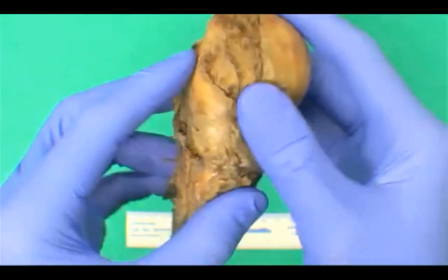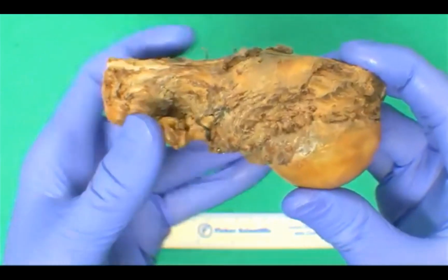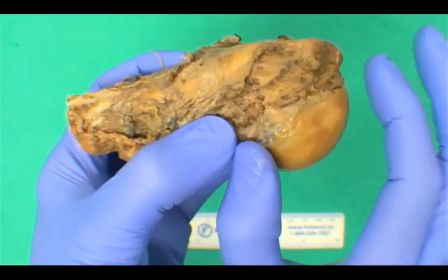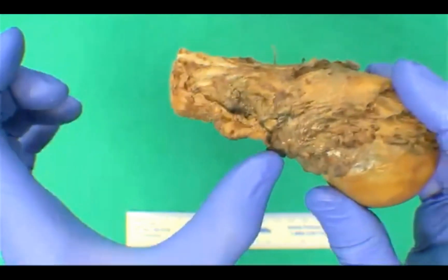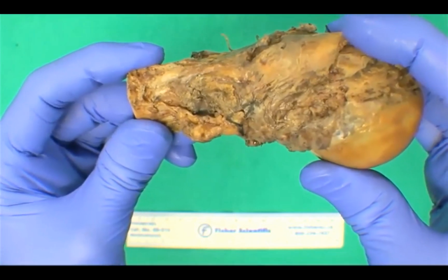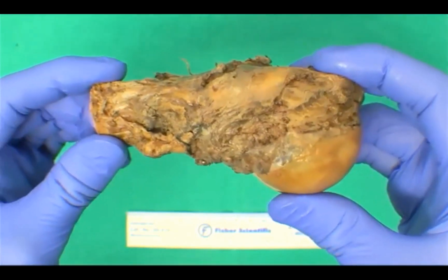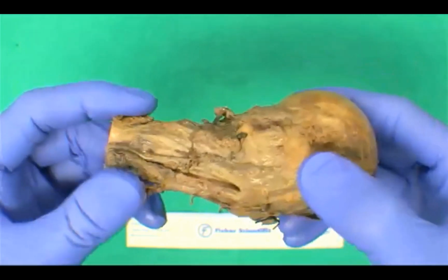Okay. When we think about the anatomy of long bones, we generally have the epiphysis, which is the rounded portion covered in cartilage. And as you move into the shaft of the humerus, you get the diaphysis. Okay. Let's ask our next poll question. How many margins are there in this specimen?